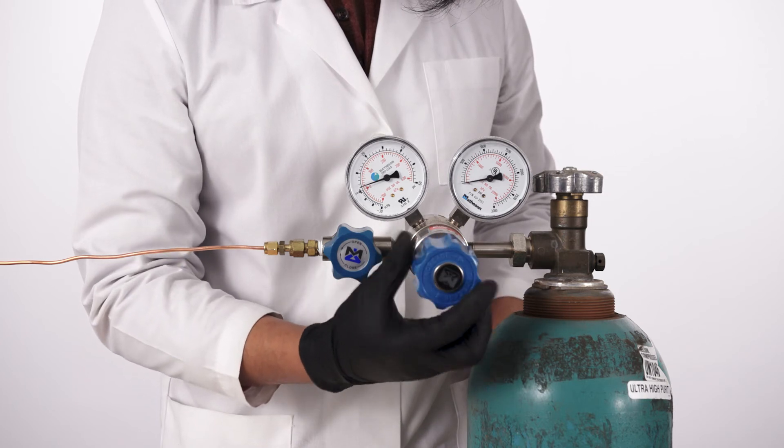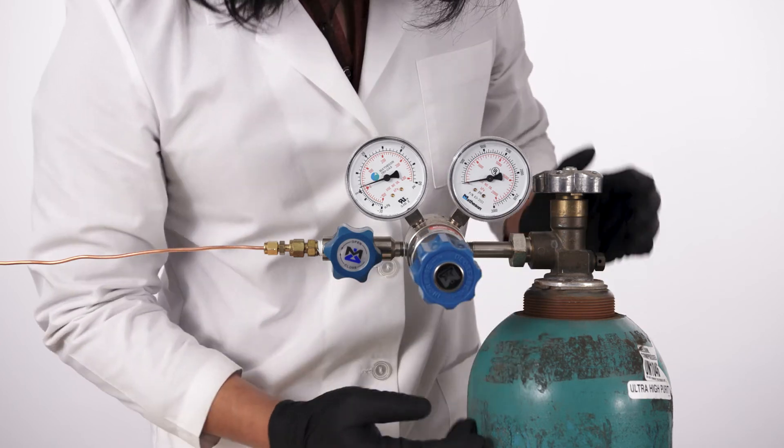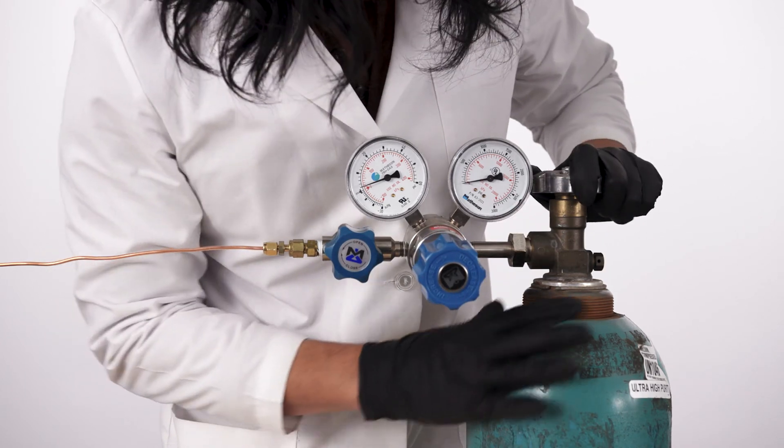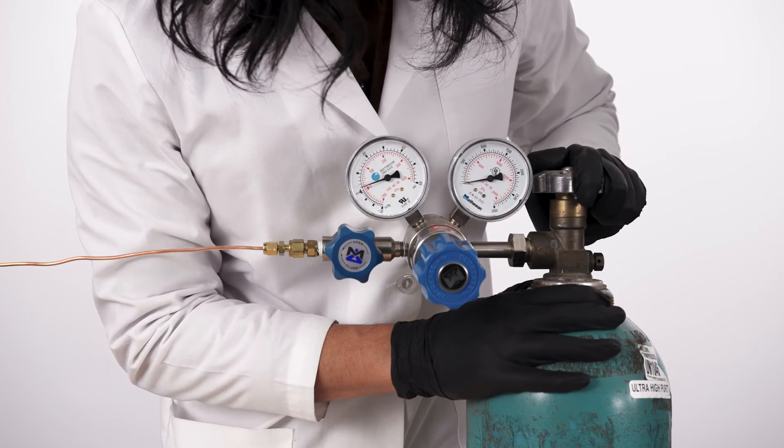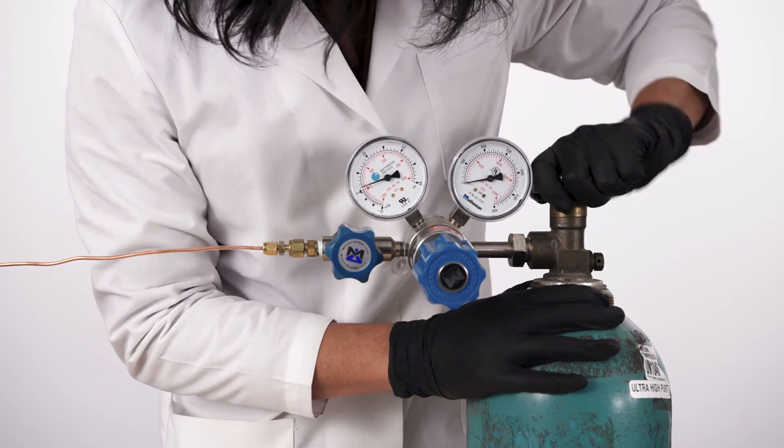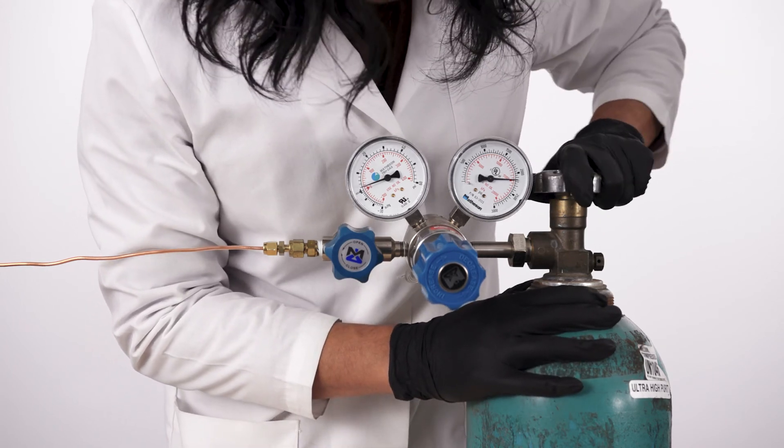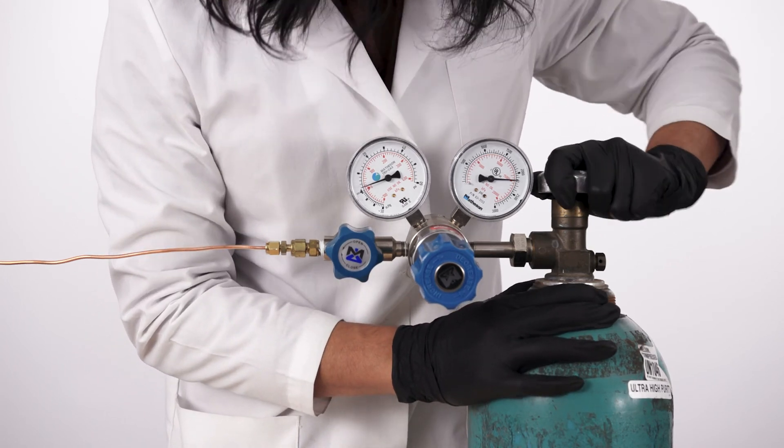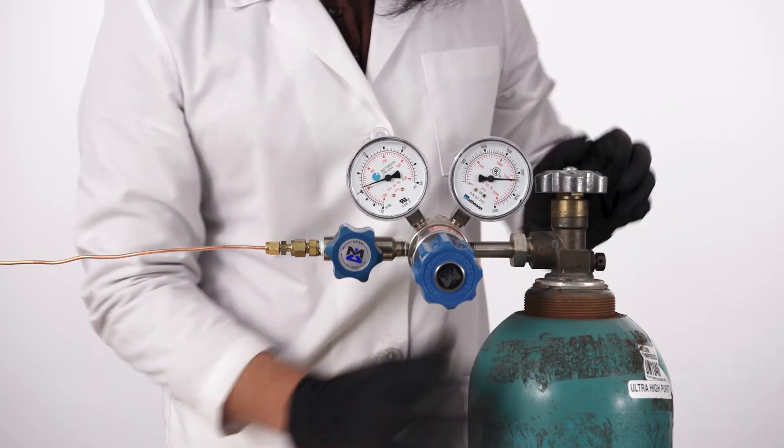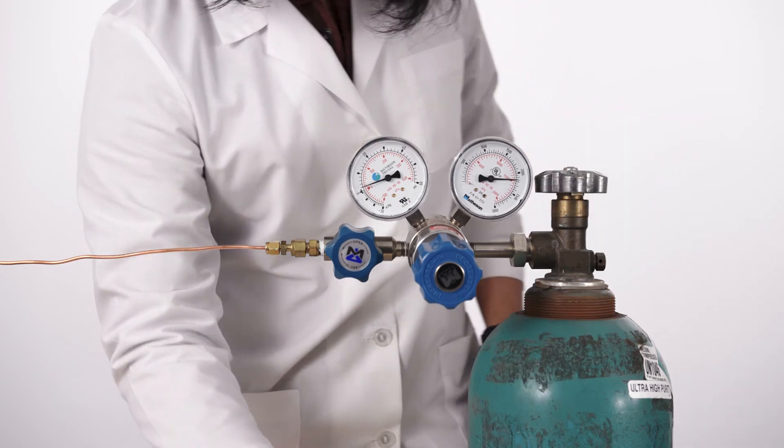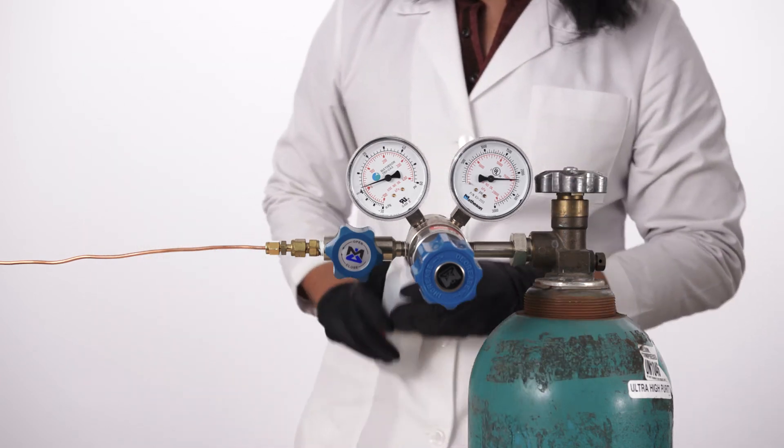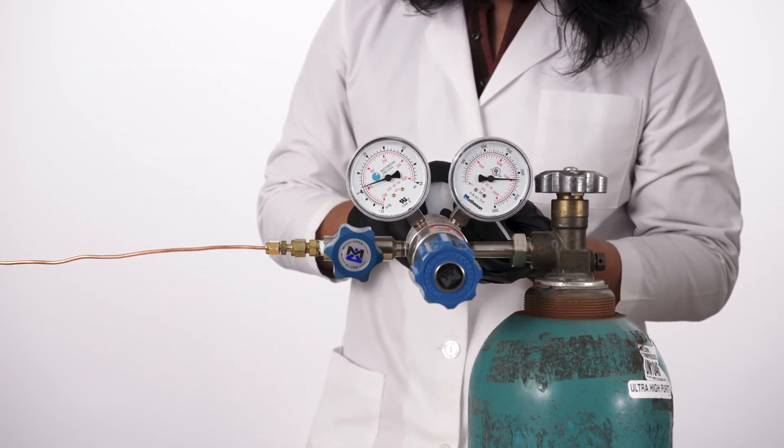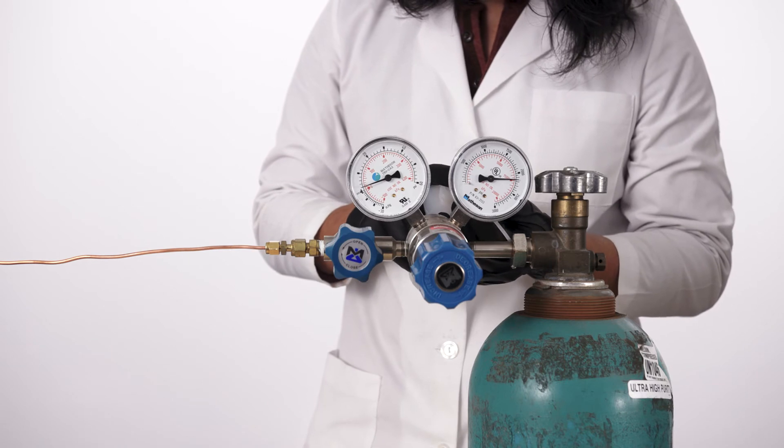Turn on the main gas cylinder shutoff valve briefly to pressurize the regulator, then close it once the high-pressure gauge can take a reading. The high-pressure gauge should read greater than 500 PSIG. Apply SNOOP on the connection between the regulator to the gas cylinder.